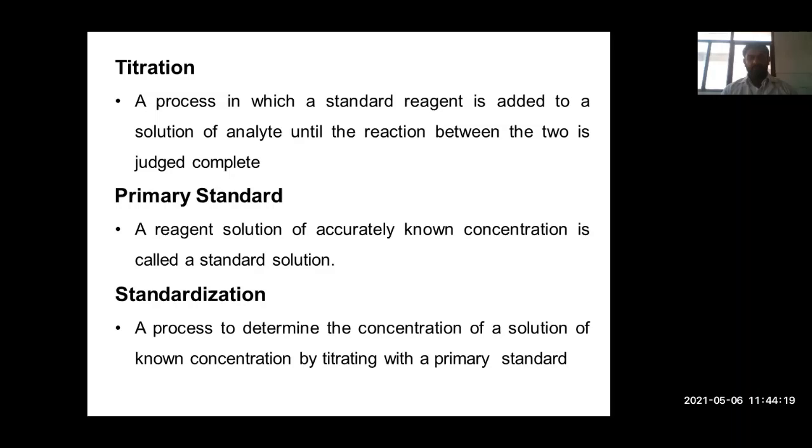Titration is a process in which a standard reagent is added to a solution of analyte until the reaction between the two is just completed or judged complete. Primary standard is a reagent solution of accurately known concentration.